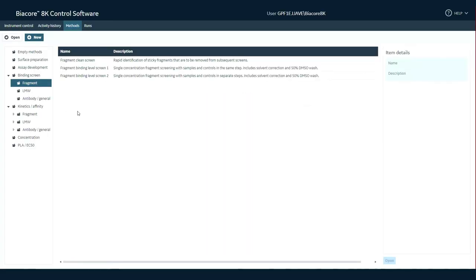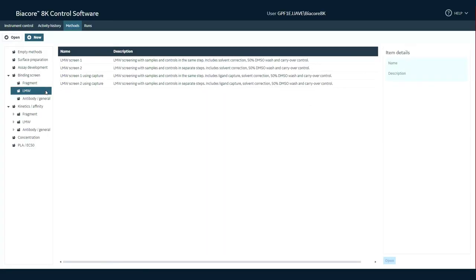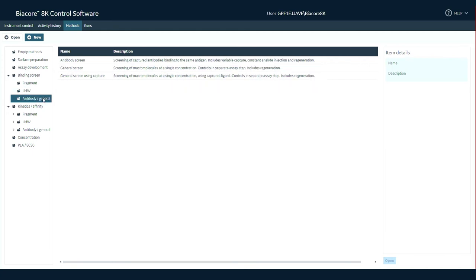Automated analysis dramatically reduces time to results, allowing you to focus on interpretation of data and in designing the next assay.